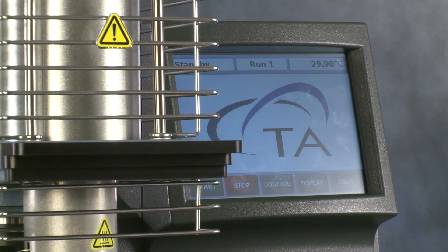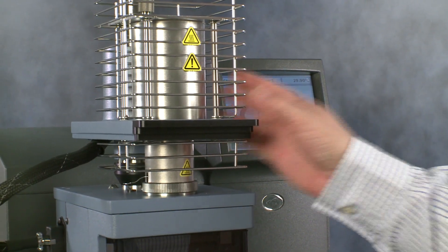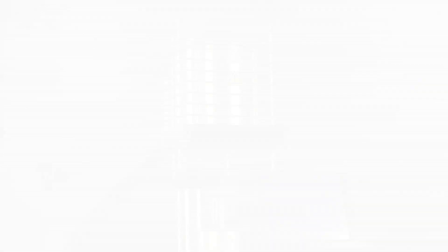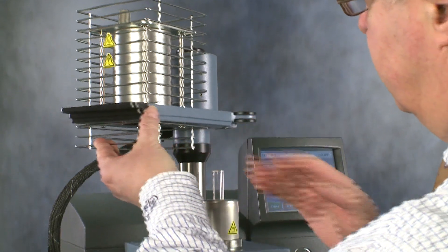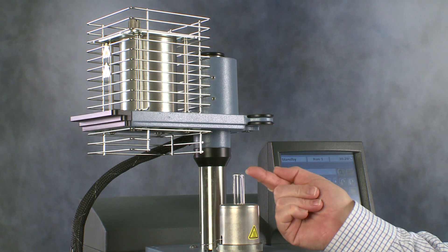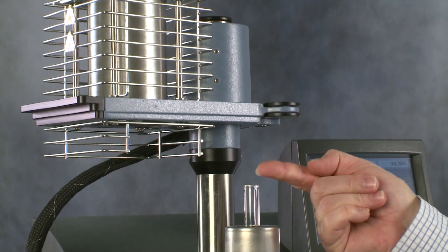This is the TMA Q400. It consists of a mechanical part and a furnace. We will open the furnace from the touch screen by clicking furnace open apply. Then for easy access, we can turn it backwards. Here we have the sample stage where the sample will sit with a probe on it, and the thermocouple which will measure the temperature of the sample during the measurement.